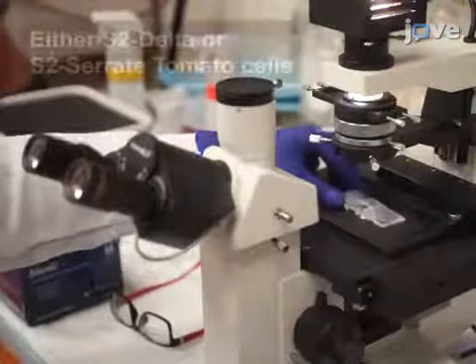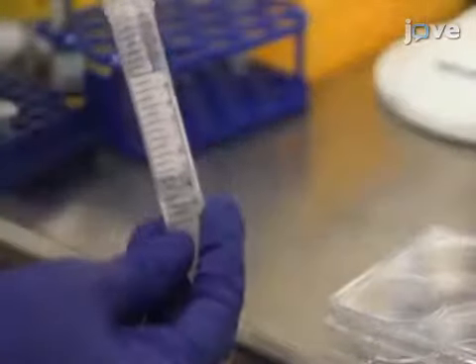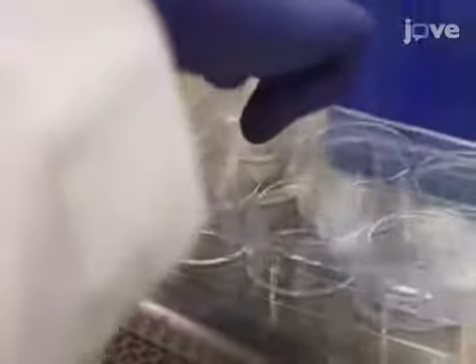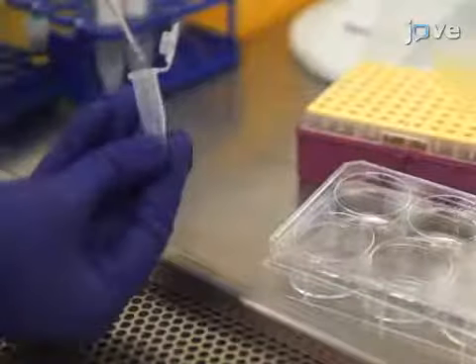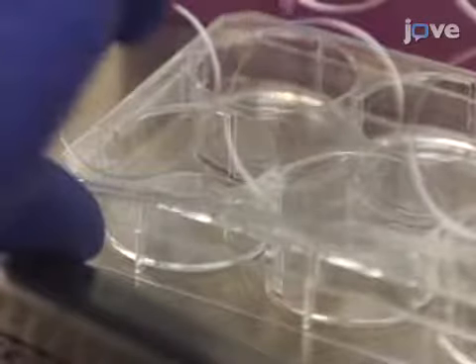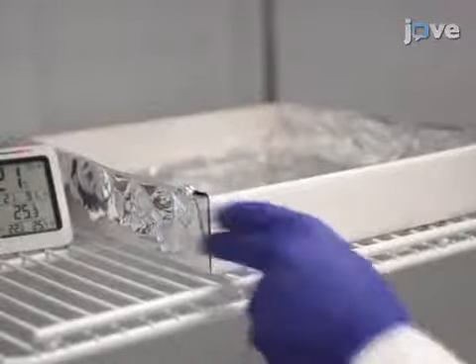After incubation, count the signal-sending cells manually using a hemocytometer and plate 5 × 10⁶ stable cells in each well of a 6-well plate in 1 ml per well of supplemented Schneider's medium. Then add 0.7 millimolar of copper sulfate to induce the expression of ligands and incubate the cells at 25 degrees Celsius for 3 hours.